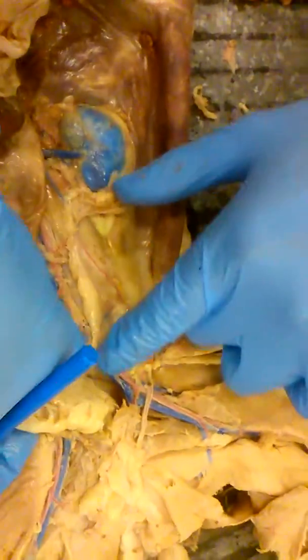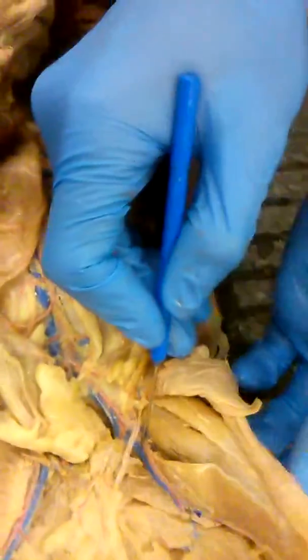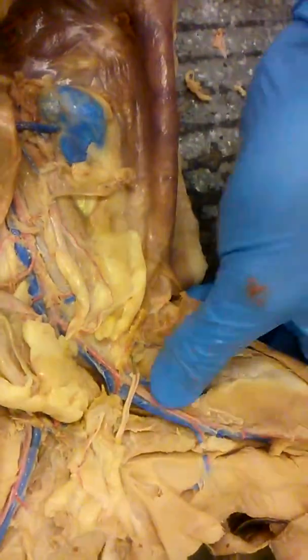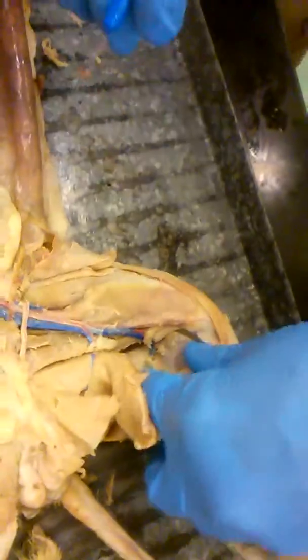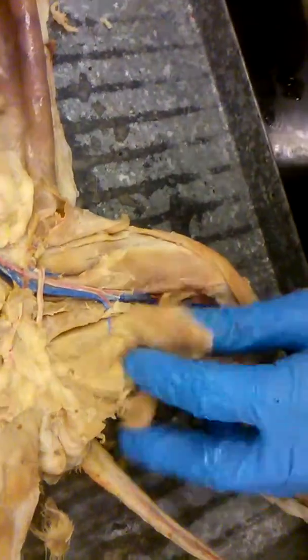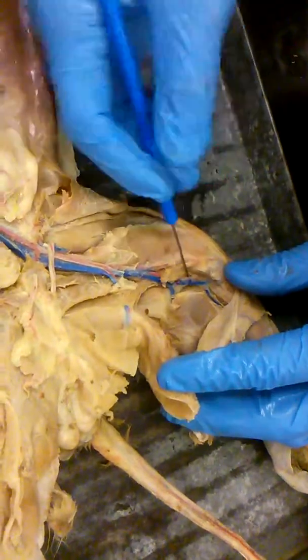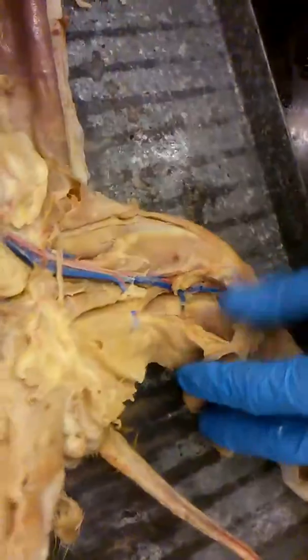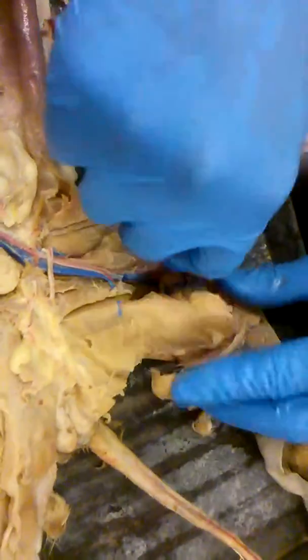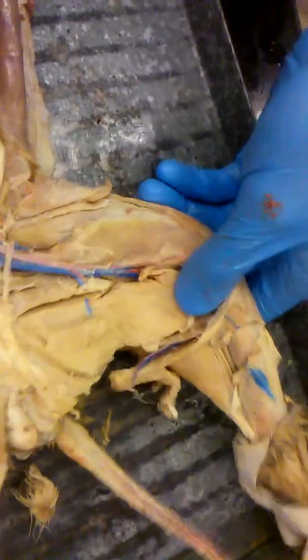So once it passes down, it's the iliac right here. Once it gets into the leg area, it's the femoral. Femoral there. And she said our cat didn't have the great saphenous one. So down in here, you're going to have your popliteal artery. Popliteal. Yeah. With those, it's less about where it splits and more about the area of the body it's in.